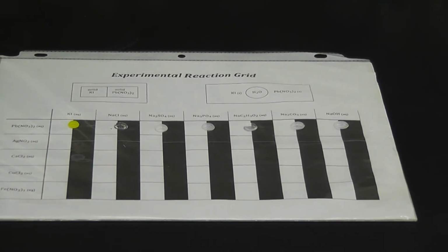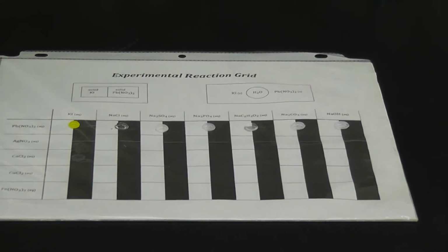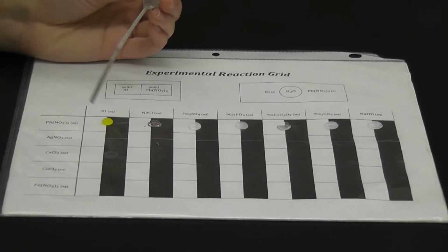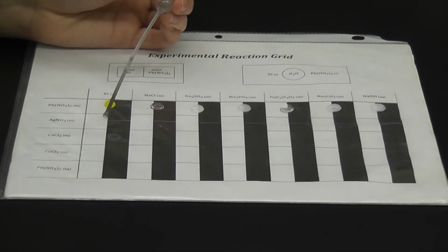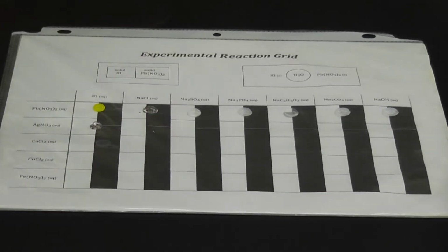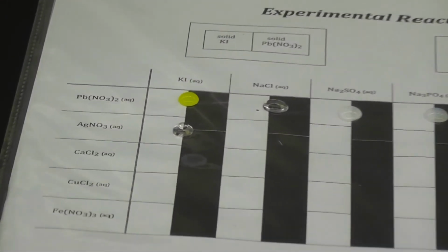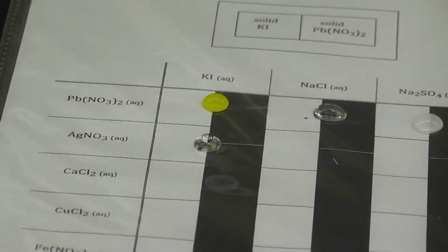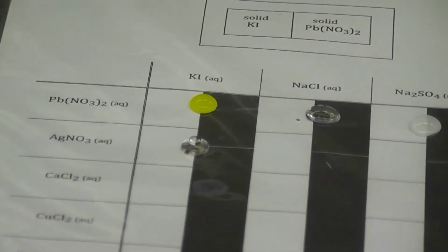So this time we're using silver nitrate going across horizontally. I can get this. It has a different bottle, and it has a darker bottle because it's light sensitive. Okay, so we're going to put 1 drop of the silver nitrate. Same procedure. 1 drop of the silver nitrate. Okay. 1 drop of the silver nitrate. And we're going to do the same process.